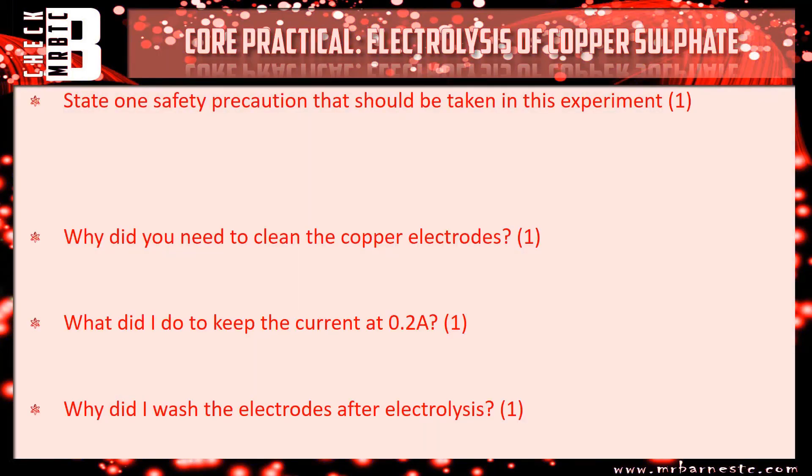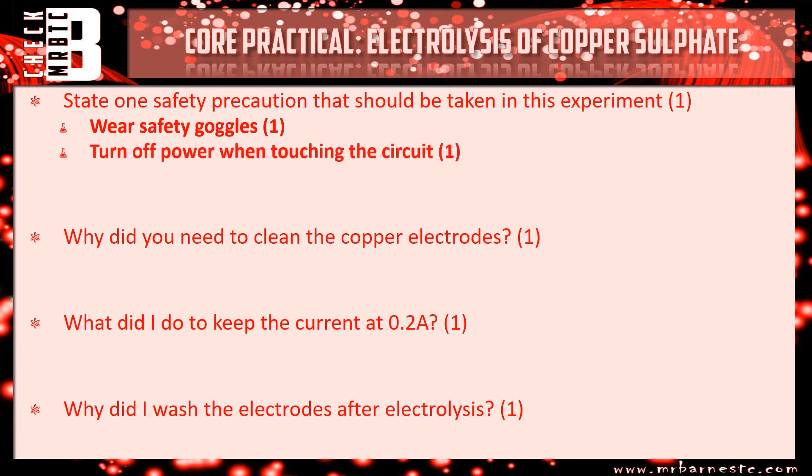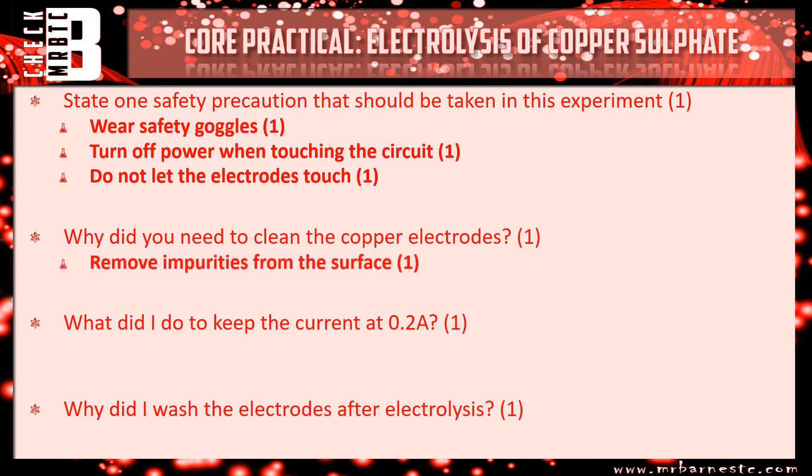There are quite a few safety precautions that should be taken — any one of them would have got you the mark. The obvious one: wearing safety goggles. There's also making sure the power is off when you're touching the circuit so you don't electrocute yourself, and making sure the electrodes do not touch so you don't get any sparks. Why did you need to clean the copper electrodes? To remove any impurities from the surface so that the copper can be electrolysed.